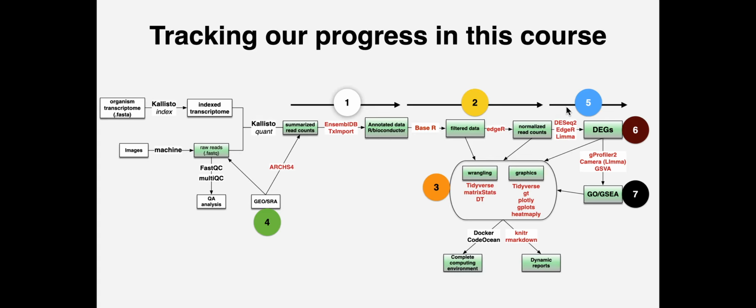And then we came back, now that you have multiple ways of getting into this workflow with your own data or public data, and recently carried out a formal differential analysis to identify differentially expressed genes between patients with this disease that we're studying in this class and patients or endemic controls.